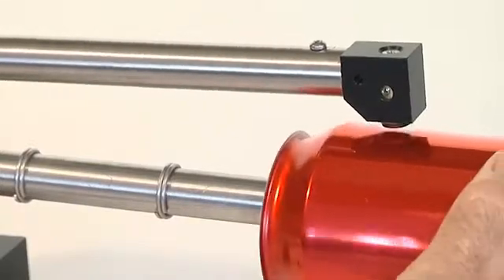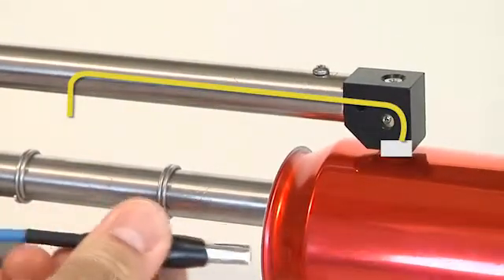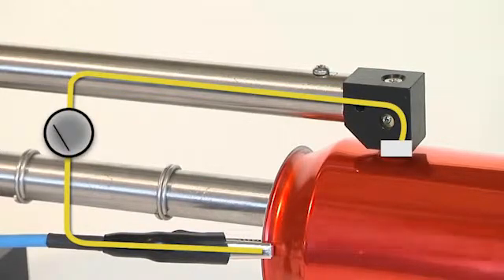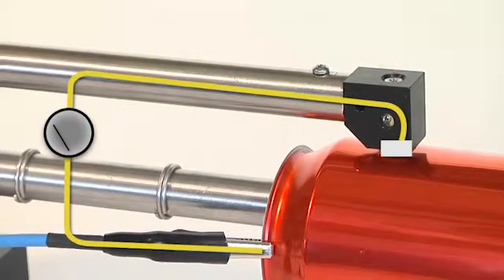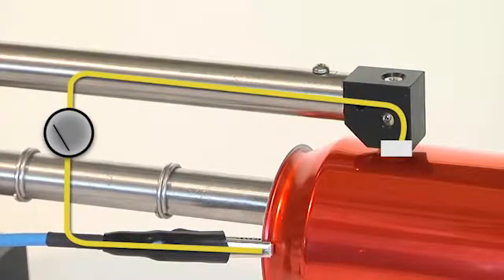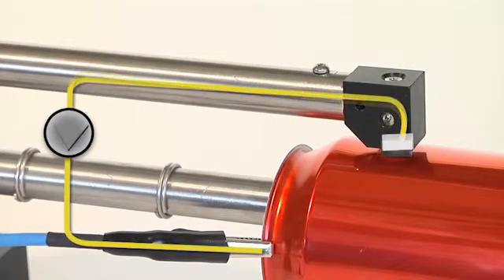The probe tip forms an electrical contact with the coating along with the earth lead contacting the can body. A circuit is formed allowing the capacitance to be measured and as the coating's capacitance is inversely proportional to the coating's thickness, a precise measurement of the coating's thickness can be obtained.